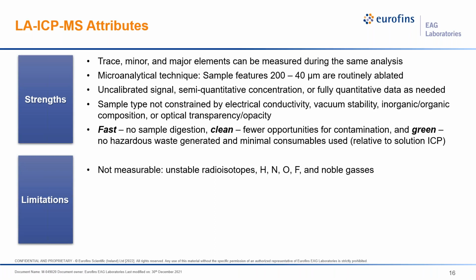On the limitations front, same problems as you have for solution ICP-MS. You cannot measure unstable radioisotopes. Hydrogen, nitrogen, oxygen, fluorine, and noble gases are all out.